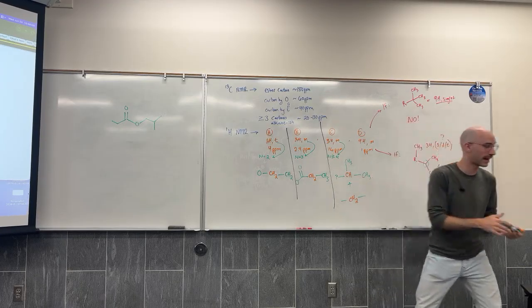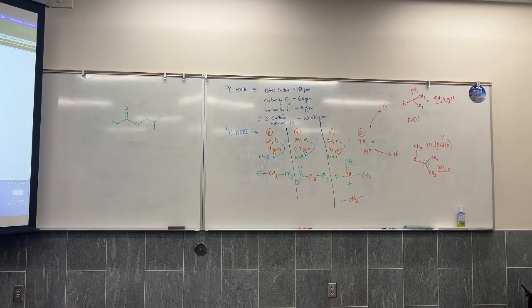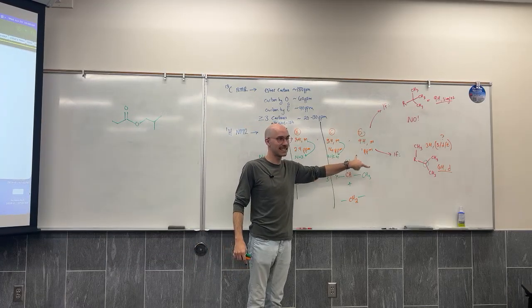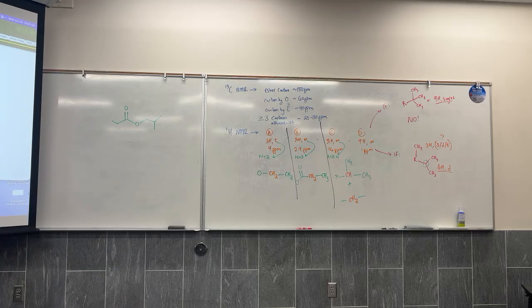Now, when we come back with that information and we look at that 1H signal, oh, I see it. See the edge on the left? Peak, peak, peak. Mixture of the two signals, and then on the right, peak, peak. So there's this broad multiplet showing up from the 1H because the 1H had at least 6 neighbors. So the 1H signal is going to show up as at least 7 peaks. And then there's this nice triplet sitting right in the middle, overlapped with each other.